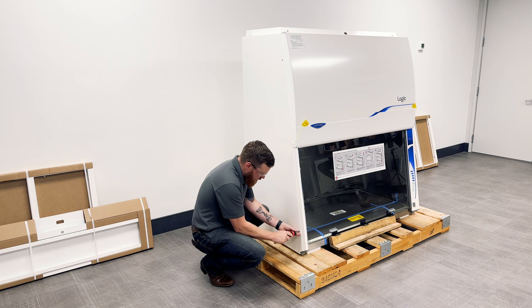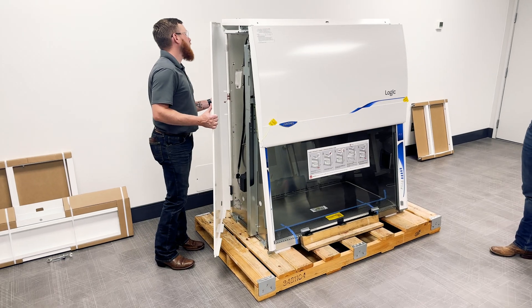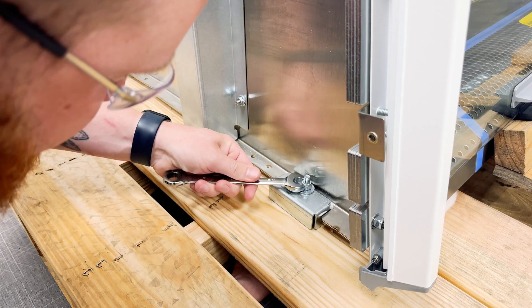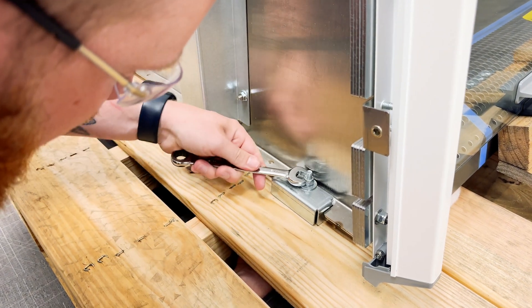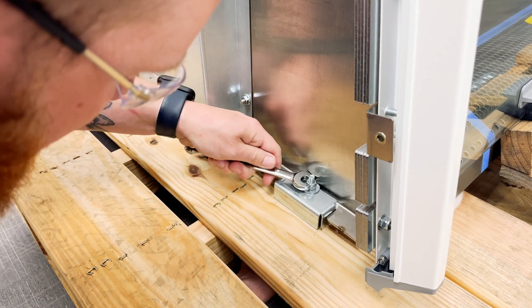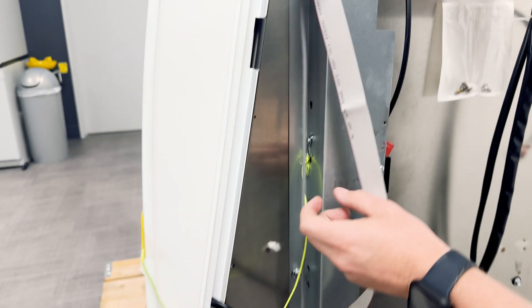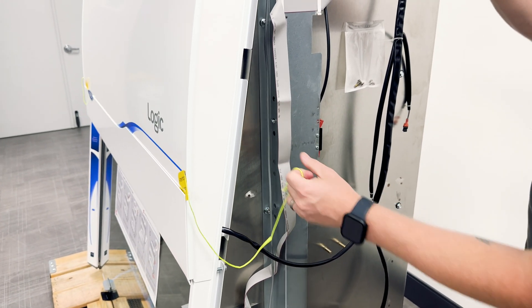If any parts are missing, contact LabConco for assistance. Next, open the BSC side panels to remove two screws from each panel with a number two Phillips screwdriver. Once opened, use an adjustable wrench to remove the bolts attaching the BSC to the pallet during transit.